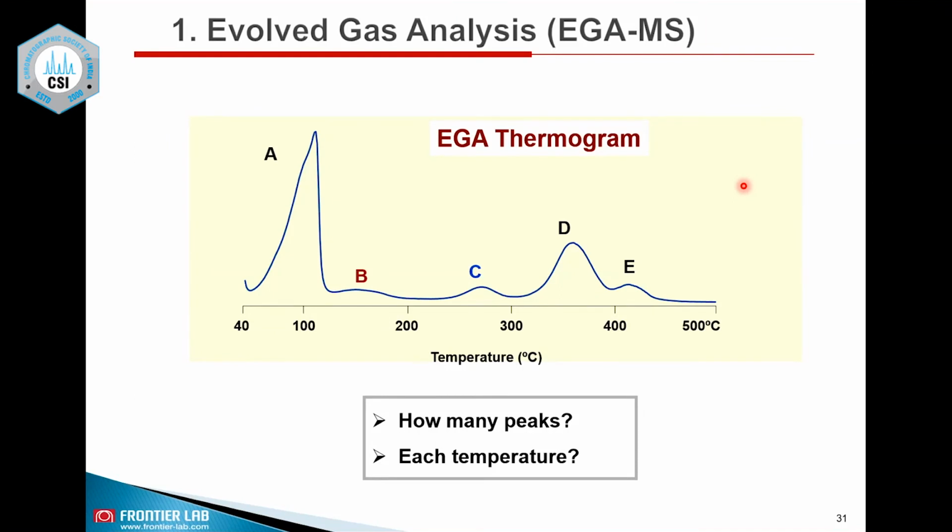Okay, eyeliner is a cosmetic that has a lot of water soluble polymer, also some solvents. If they want to really characterize this, they do not want it to evaporate very quickly, because then the customer cannot use it. It has to maintain a certain level of evaporation period so that the customer can buy and use it properly. Also, the chemicals they are using are not toxic to humans. So this characterization requires a technique like Py-GCMS.